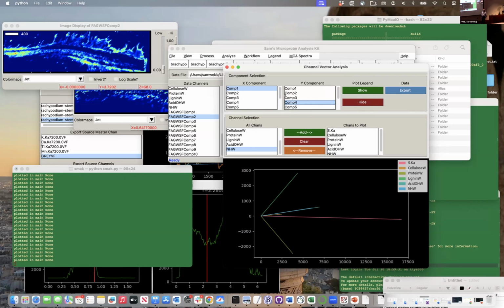Yeah, this is great, Sam. For clustering, I think you talked about K-means and Gaussian. Does one work better for most of the data sets you work with, and why? Yes.